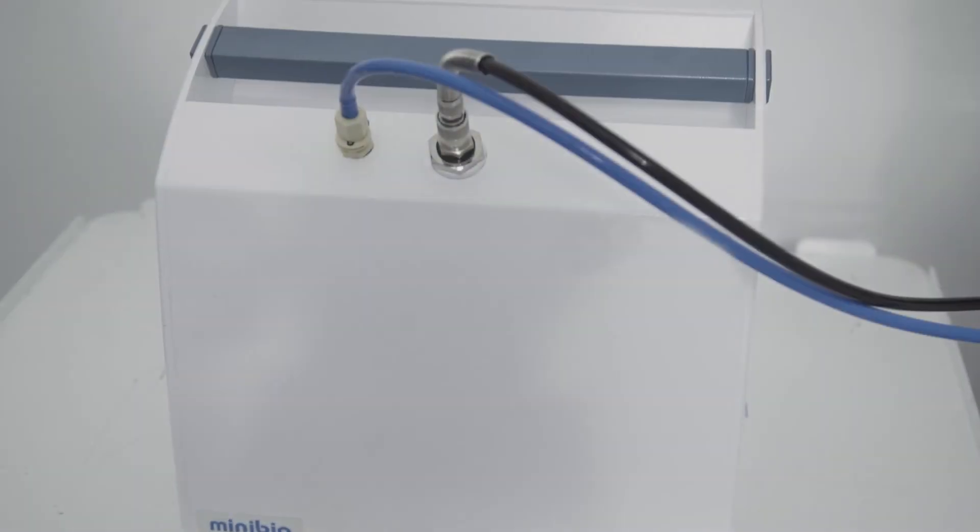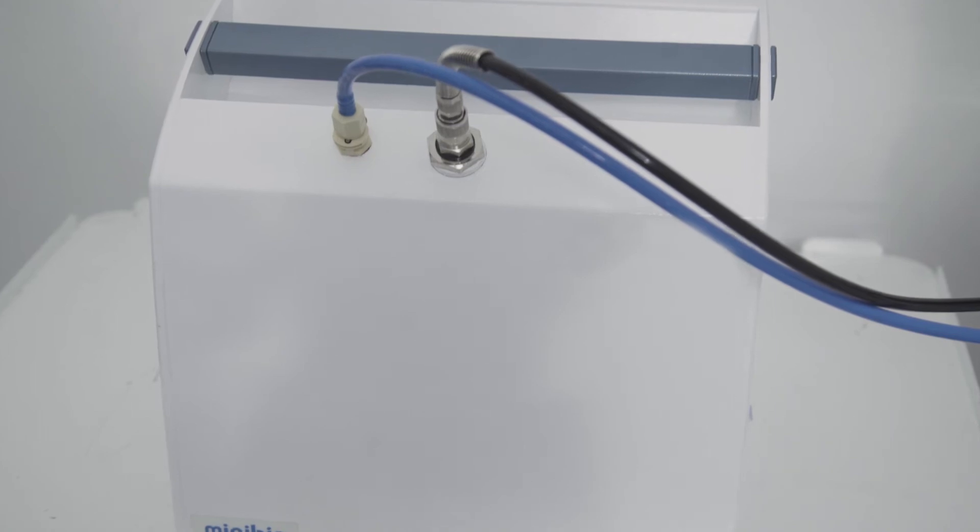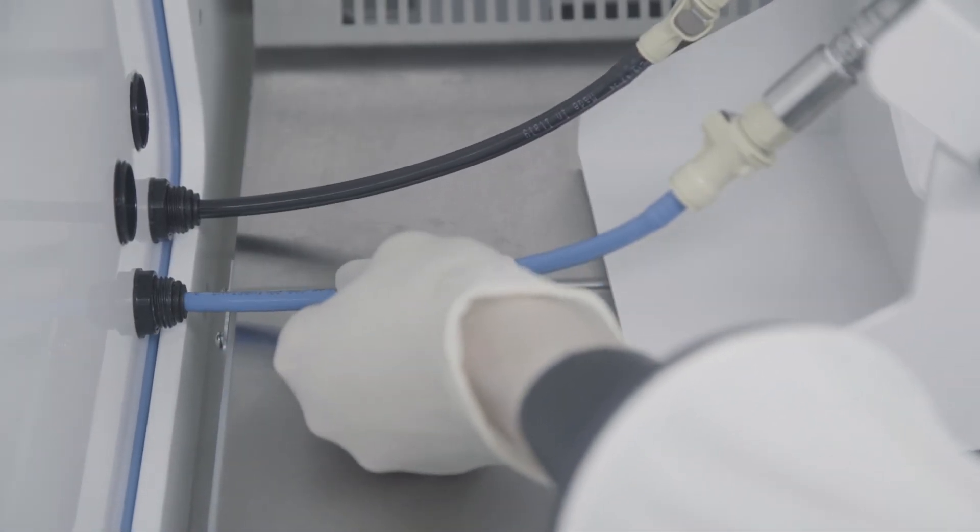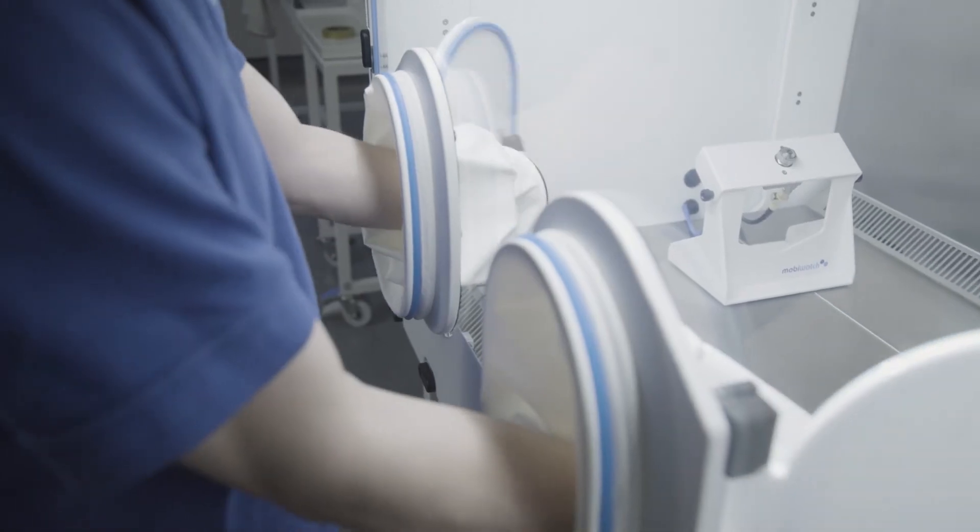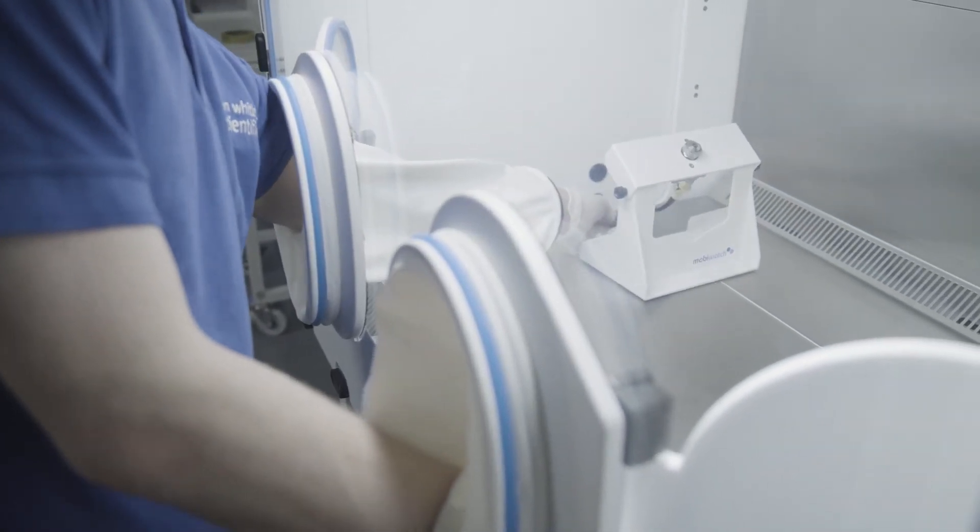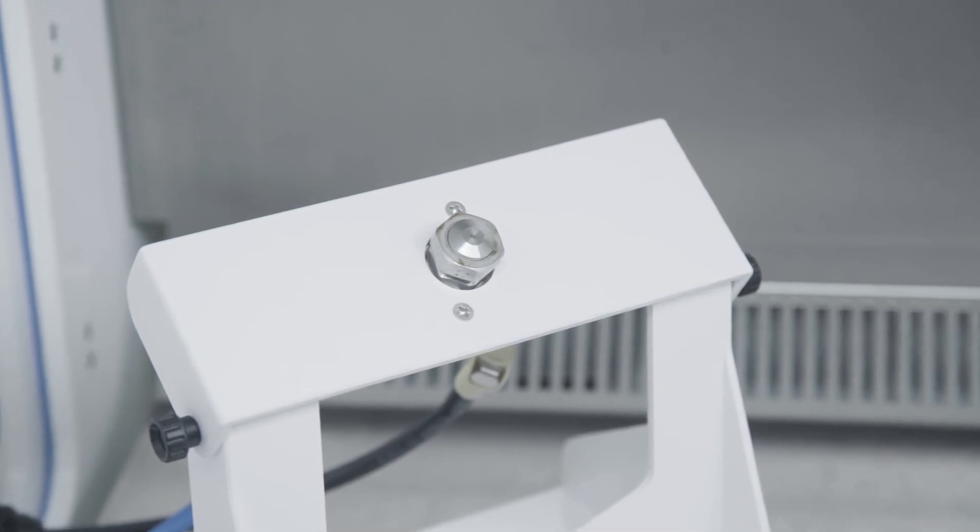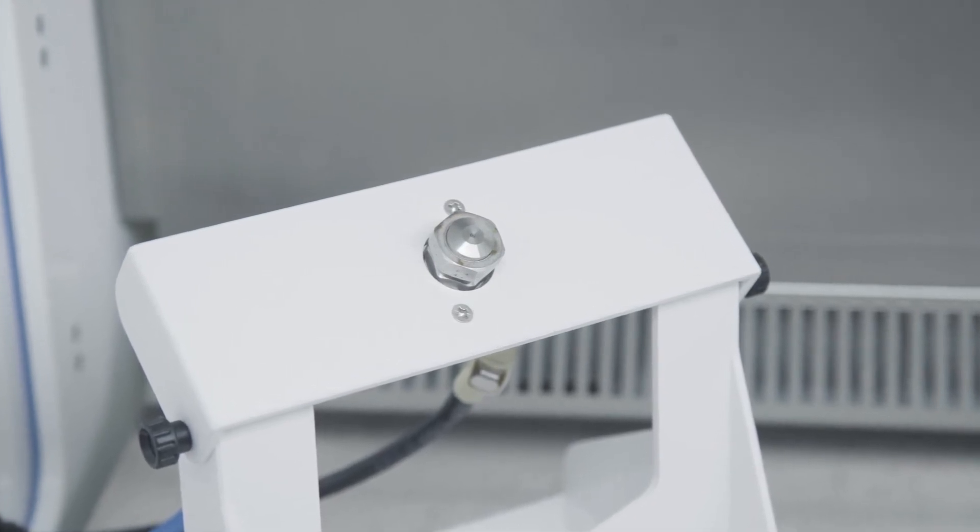Hydrogen peroxide fogging can be used to decontaminate the Whitley H135 GMP Hypoxie Station. We've carefully tested and selected the equipment and method best suited to this specific workstation, and the complete solution is available to purchase as an option.